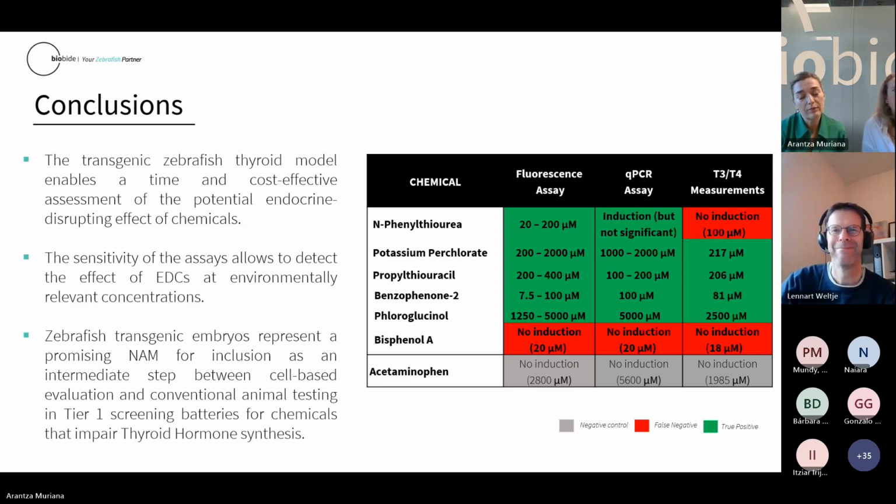Yeah. Thanks. Okay. Because sometimes it's a criticism that we all get when we start working with someone the first time in zebrafish. But then when we do the bioavailability analysis, which we can do not only for T3, T4 but also for the compounds themselves, we realize that the real concentration inside is not the one that we are putting in the media at all. Yeah. Thank you for the question.